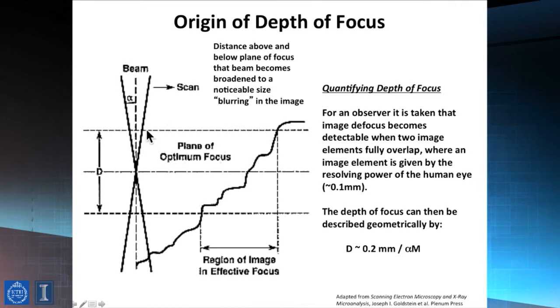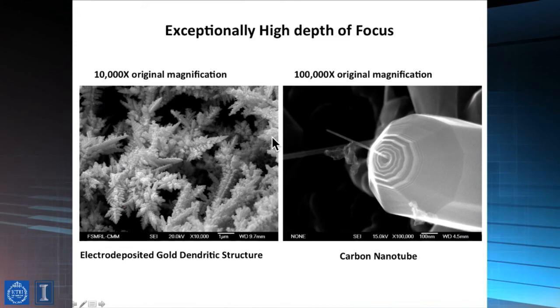Because, for example, here's a beam, here's a sample plane which is tilted relative to the beam axis, and you'll notice that features lying above and below that focal plane will actually have an impacted resolution from both top and bottom related to this loss of clarity due to the divergence of the beam, right? But then we could think about how good might that be, all right?